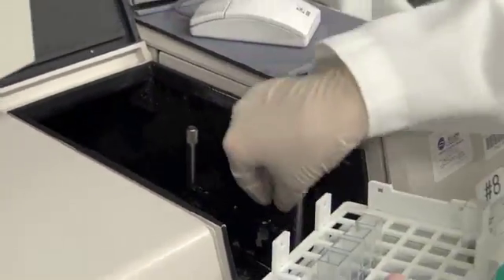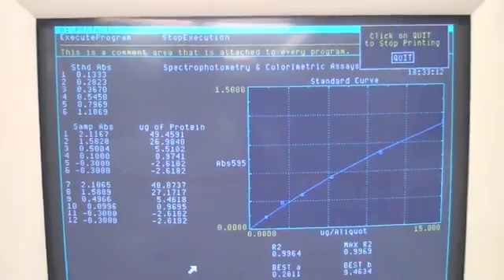Once you have printed the data, clean up your station, and do not forget to take out your samples from the spectrophotometer. Close the program, and do not save any previous data.